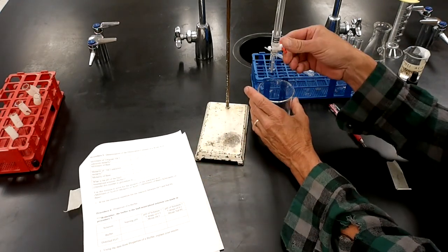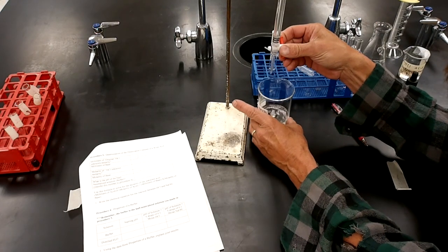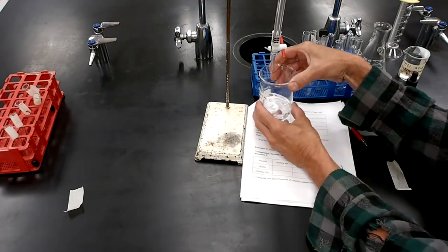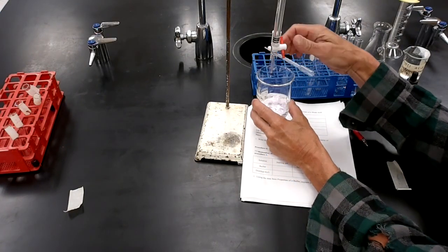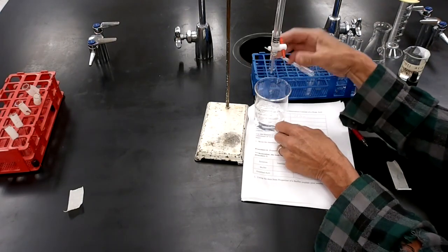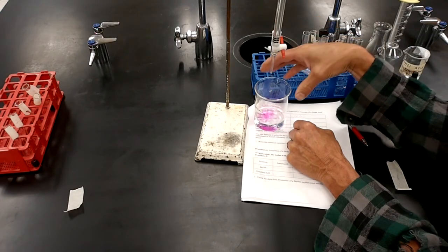All right. Now what I'll do is I will take this burette and I will open it a bit and let the base, oops, see, get a little paper under it. Little flashes of purple as that sodium hydroxide hits. See the kind of fluorescent purple in the turn? Now you've got to do this pretty slow because you reach a point where one drop goes in, it stays purple, and you don't want to overshoot.